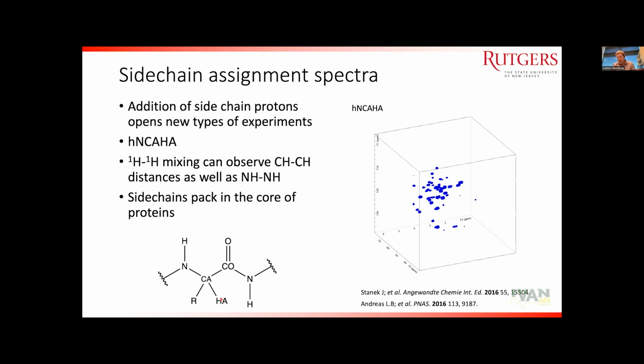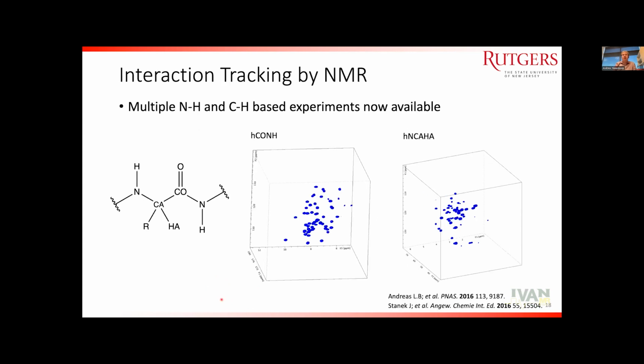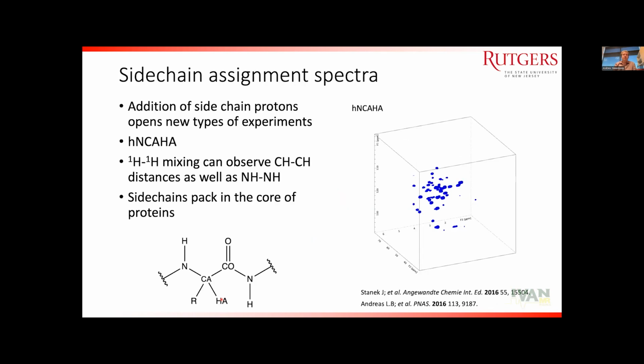So Murali pointed out that as we've spun faster and faster, our spectra are looking more and more like solution NMR, but they're still not quite there. Okay, so the slide I was heading forward to is much further into the talk, so I won't get there. So we still have a lot of ambiguity problems just in our chemical shifts. Our line widths are something like 10 times broader than solution NMR still. And so having an extra place where you can get resolution can also be very helpful.